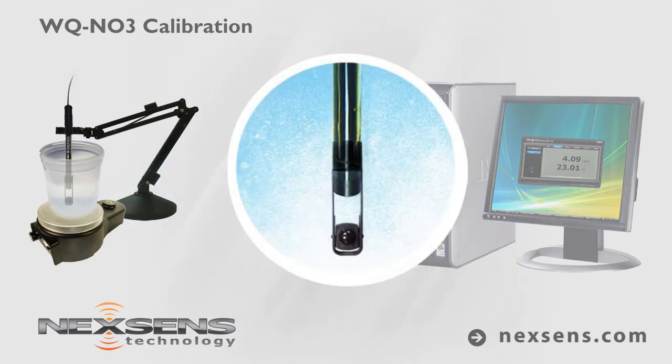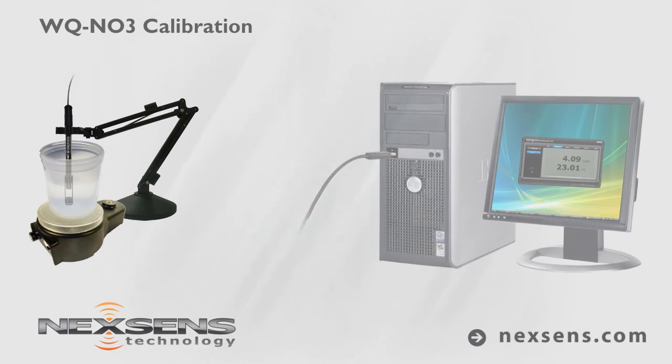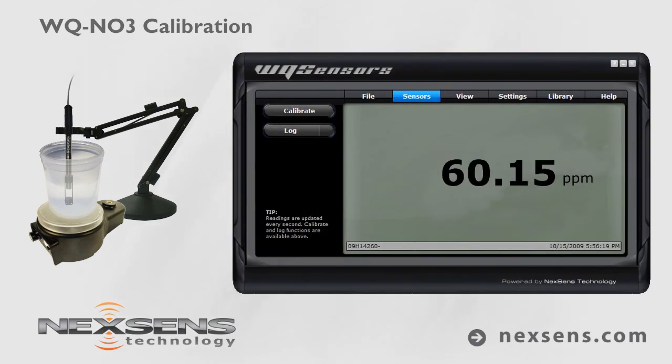Gently stir the sample with the probe, or use the sensor tip stirring adapter with a laboratory stir plate. When the nitrate reading stabilizes, the measurement is complete. Press the log button to store the readings with a date and time stamp.